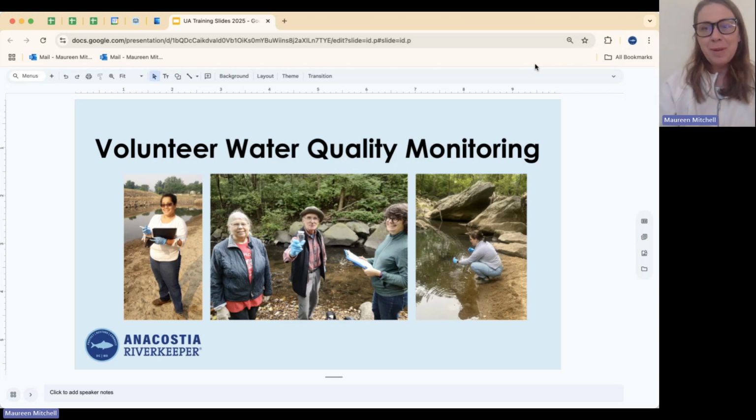If you're watching this video, it's because you want to learn more about how Anacostia Riverkeeper and its partners do recreational water quality monitoring up in the streams and tributaries in Maryland. Today we'll have a quick recording here for you to listen along, learn a bit more about what we monitor, how we monitor, why we monitor, as well as get some information on how you can get involved. There'll be a short quiz at the end of the video, and then you'll be well on your way to starting to be one of our volunteer monitors.